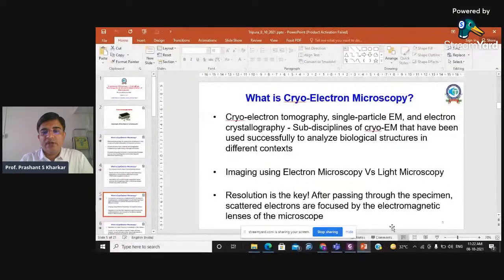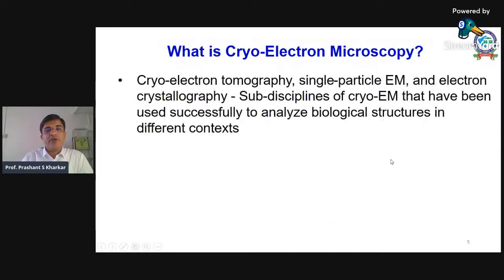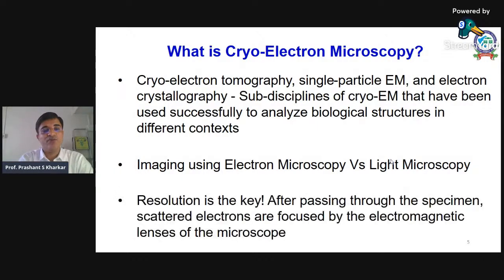Now let me come back to the presentation where I left. The point of showing that particular video was to give you an idea of how electron microscopy works. The overall principle of cryo-electron microscopy is also the same, except the cryo part, what exactly they do, and that's exactly what we are going to see.